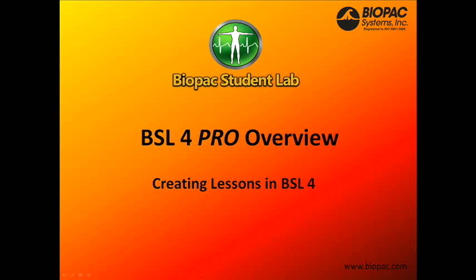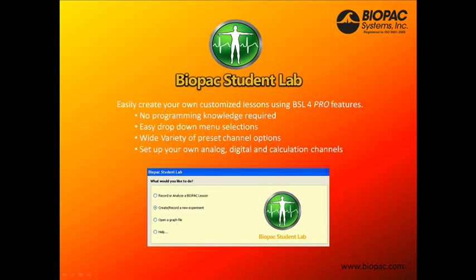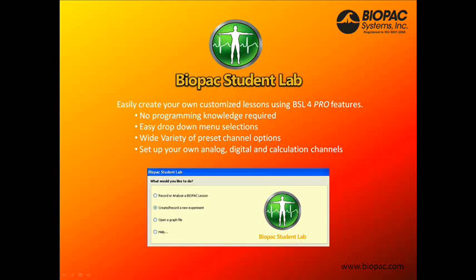Biopac Student Lab BSL-4 Pro Overview. In this screencast, we'll learn how to create lessons in BSL-4. You can easily create your own customized lessons using BSL-4 Pro features. There's no programming knowledge required.